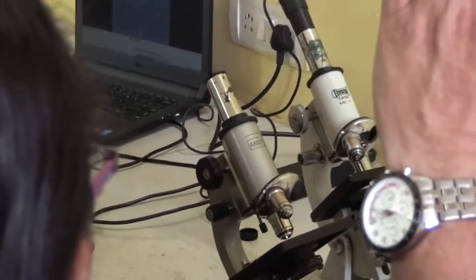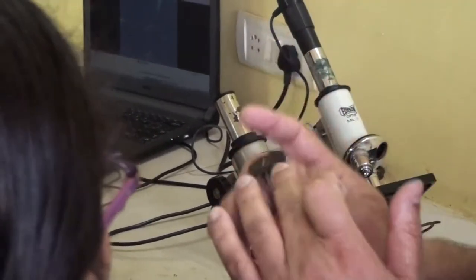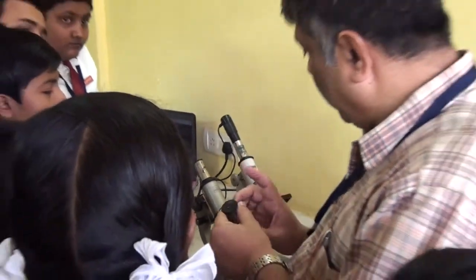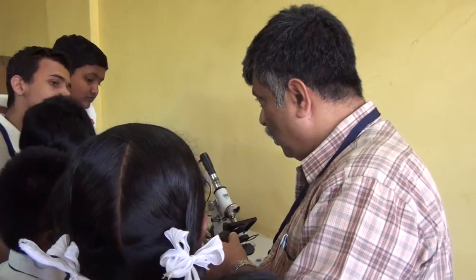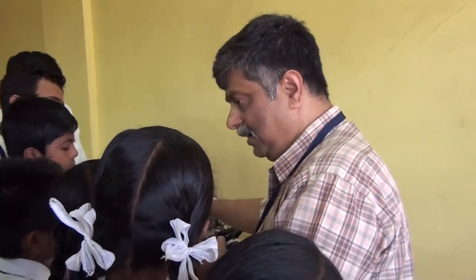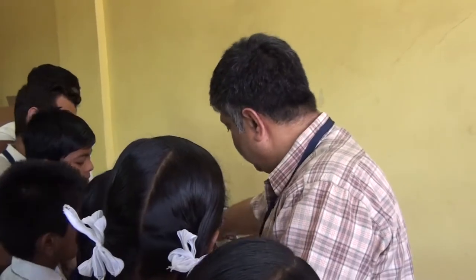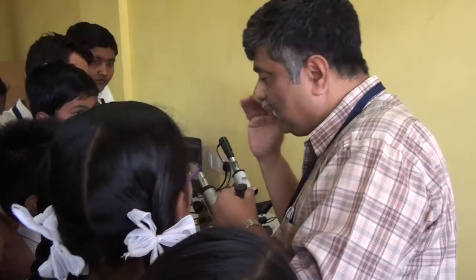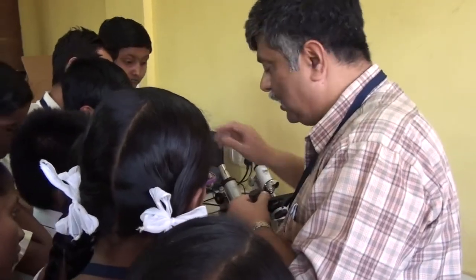It is near the eye. Then it's called the eyepiece. So in a microscope there is a reflecting concave mirror, a slide, an objective lens, and an eyepiece. This knob makes it focus. This will turn the focus.